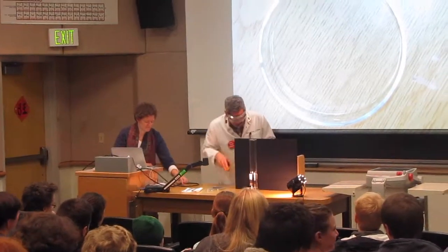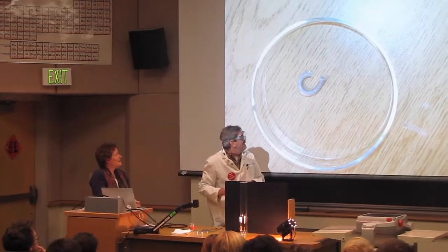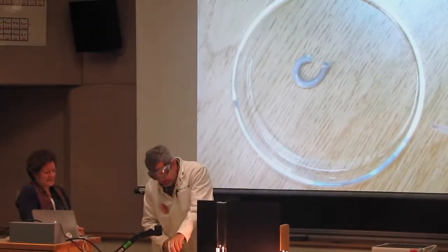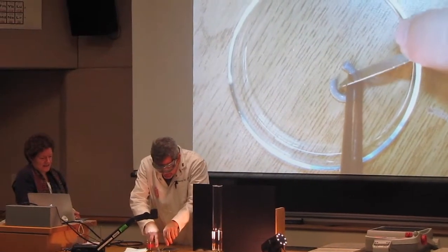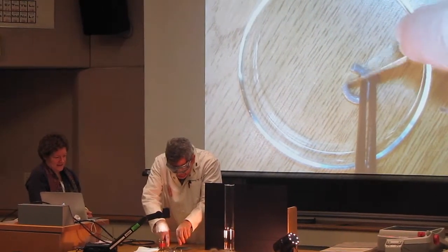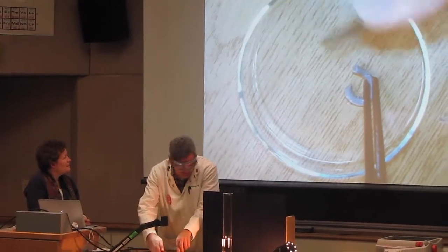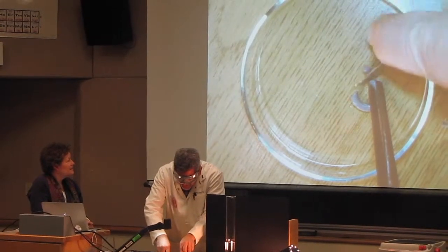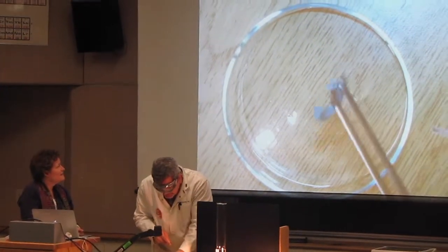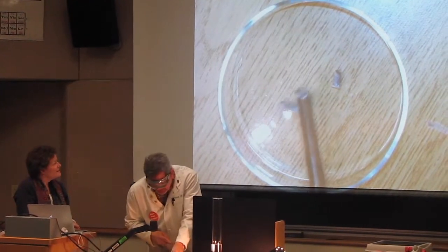Let's start off with lithium. There's some lithium. It looks dull gray on the outside. That's because it's got a coat of lithium oxide on it. This is an unusual thing about a metal. I can cut it with a butter knife. And right where I cut it, you might see it's kind of shiny. And there you see the metallic aspect of it.